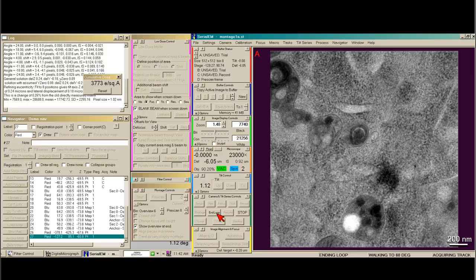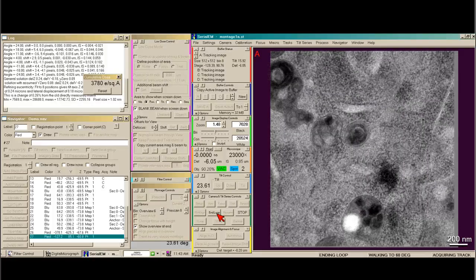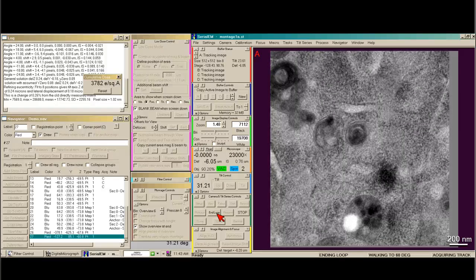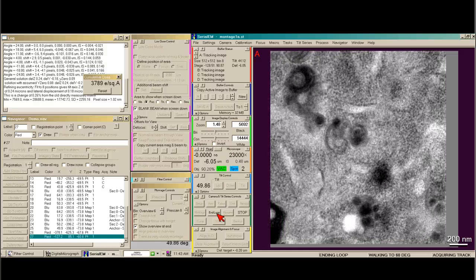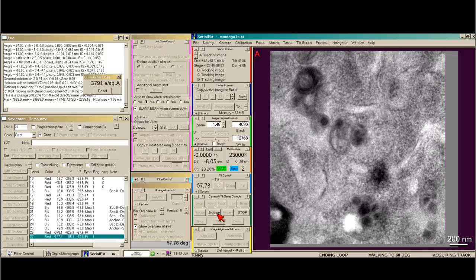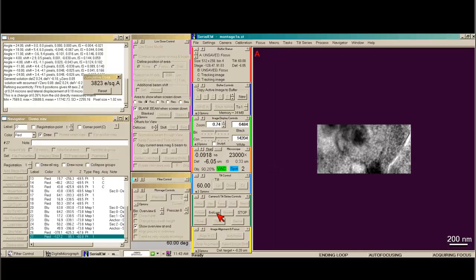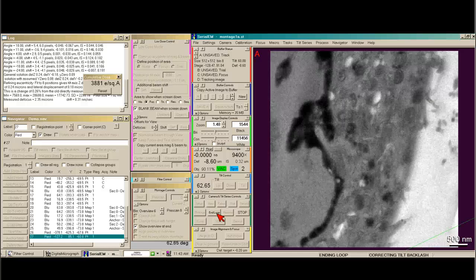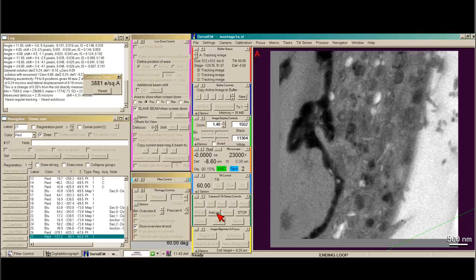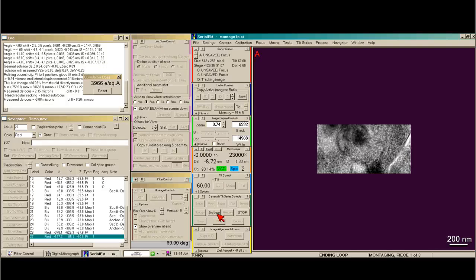So I just say go. I'm going to say end loop so that at the very top of the tilt series I can check out the first image and make sure everything looks good — not a lot of drift, decent counts, that sort of thing. We're walking up to 60 degrees first. Now we're going to focus. Then we correct for the backlash, which is the sloppiness in the stage. You can see we tilt to about 63 degrees and come back to 60, so that we're now tilting in the correct direction. Then we focus one more time, and you'll see we take the three panels of the montage, which always start at the bottom of Y and work their way up.